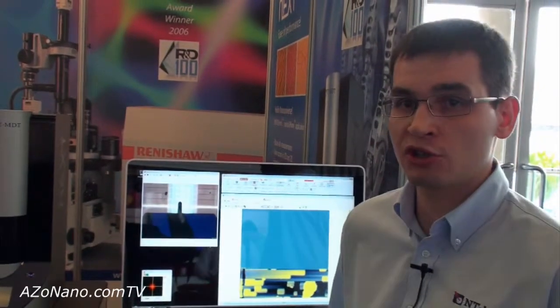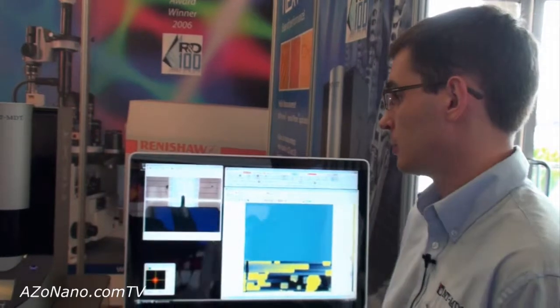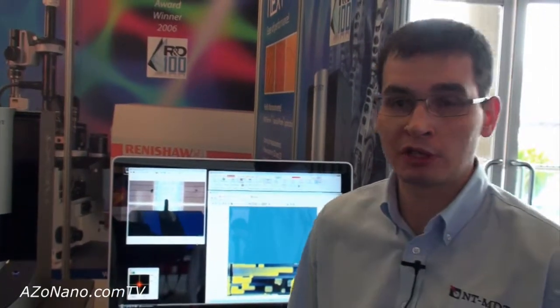The system can operate with a large scanning field of 100 micron square or in high resolution mode down to 3 by 3 micron square.